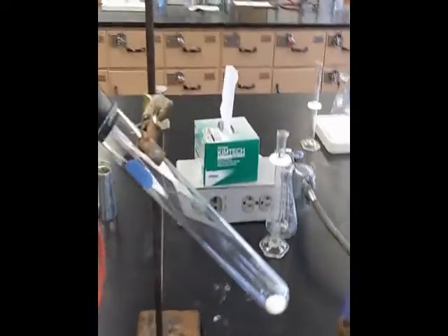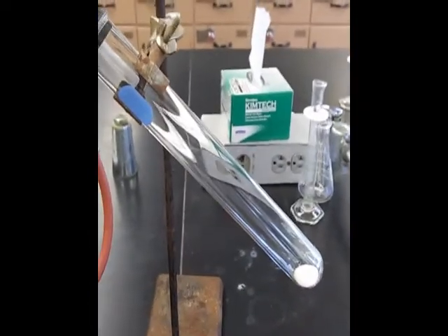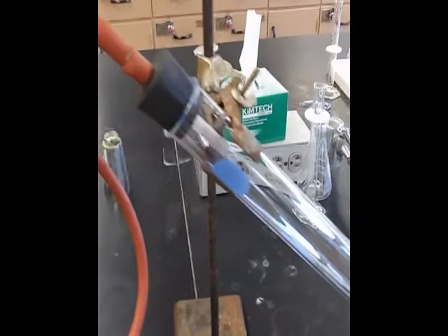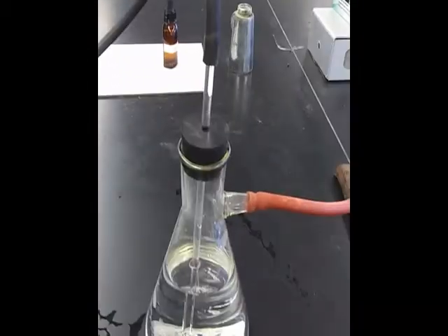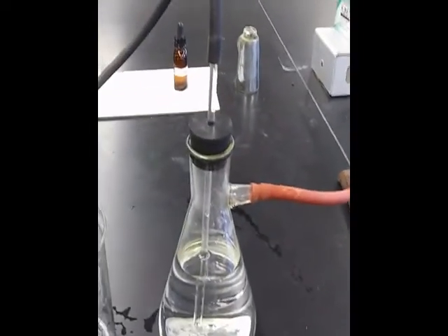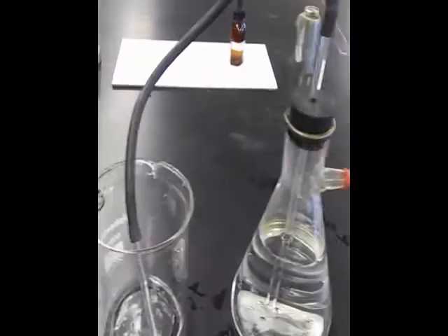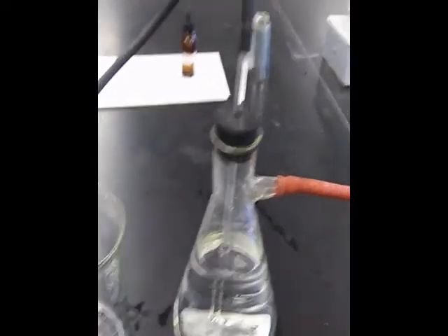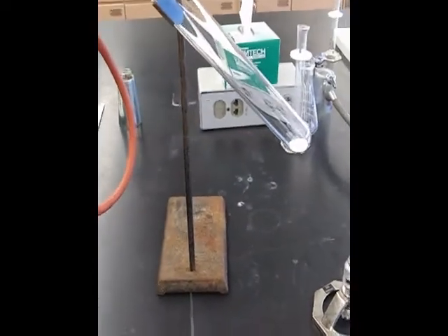So the idea is the potassium chlorate is going to decompose, and it's going to produce oxygen gas. And that oxygen gas then is going to push water from this flask into the beaker. So whatever volume of oxygen gas is produced, that volume will push the same amount of water into the beaker, and then we can measure the amount of oxygen gas that's produced.